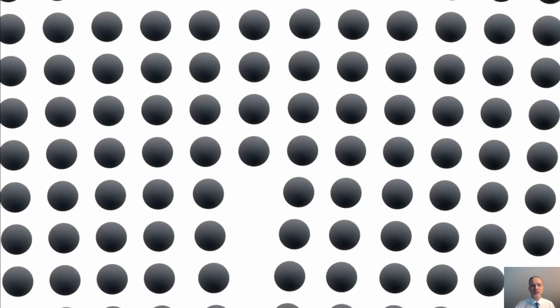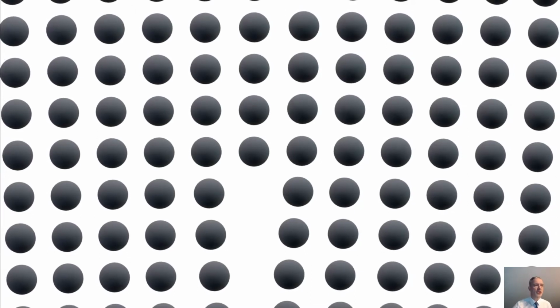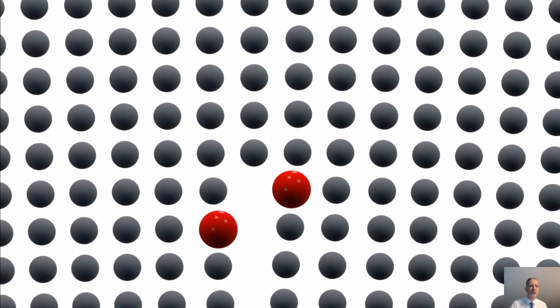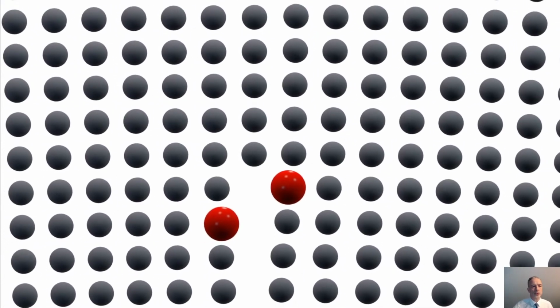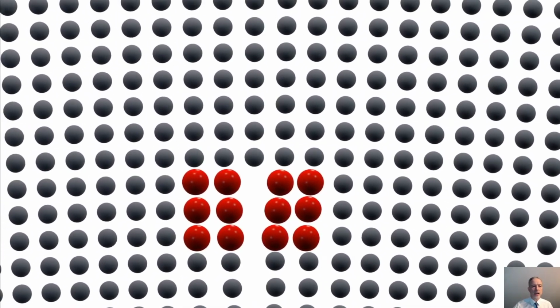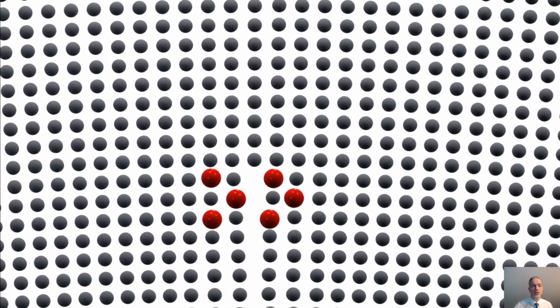Let me explain this with a couple of simple examples. We all know such a picture of a simple edge dislocation, and assume that the edge dislocation is now decorated by solutes. That can be by solute decoration, by a particle formation, or by some order structured locally. Whatever it exactly is, it is a local structural chemical state.